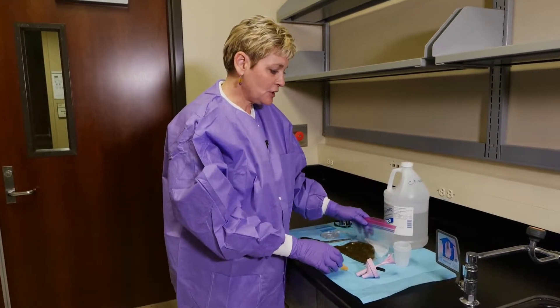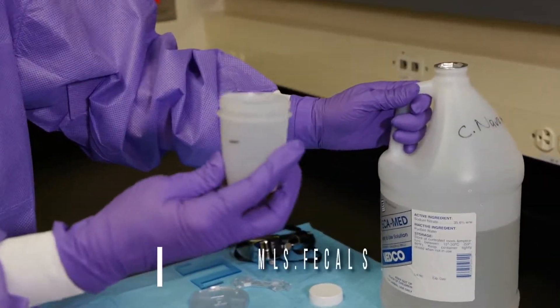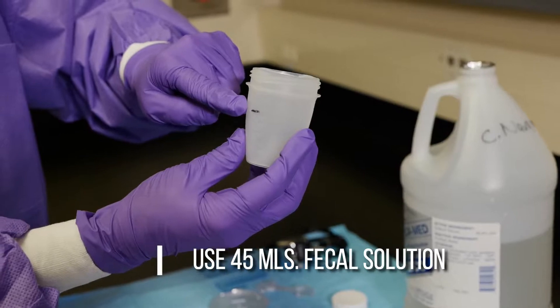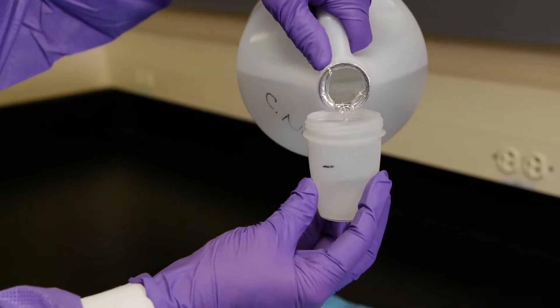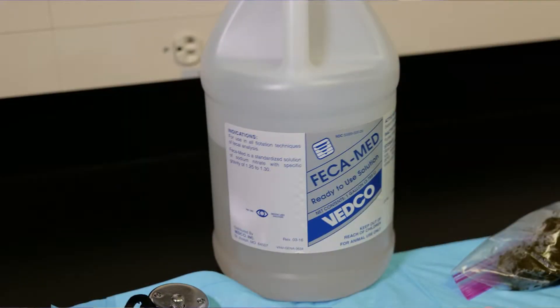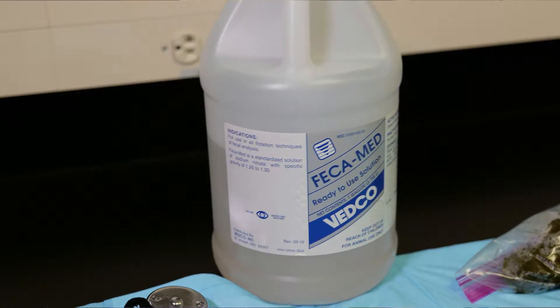The first thing we're going to do is fill our cup. You're going to use 45 mils of solution, and the lines on these cups are a little bit faint, so we used a Sharpie to mark it to make it a little bit easier to get it to the right level. This is a fecal solution — if anybody has any questions about that, you can talk to me.